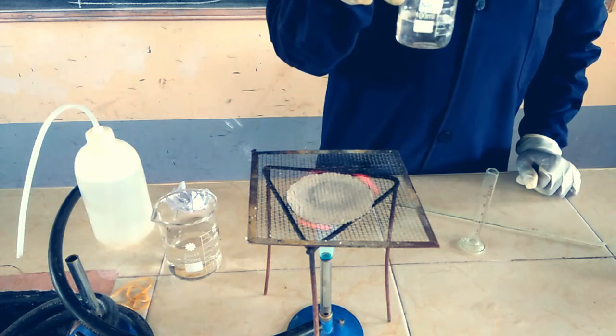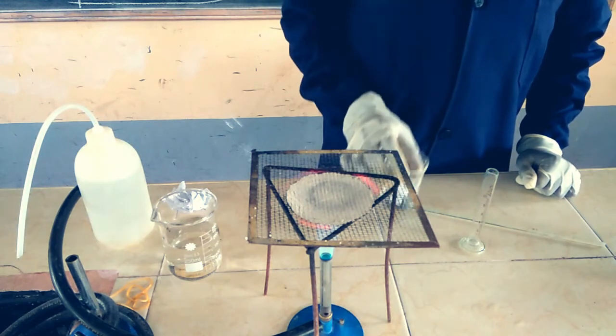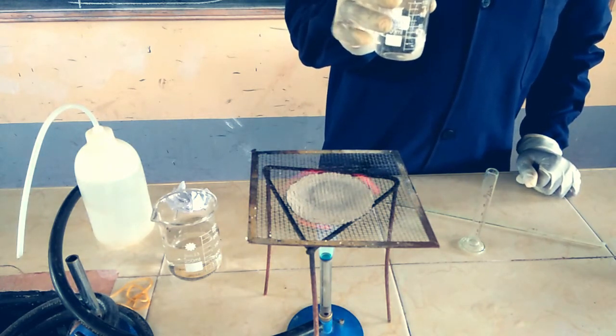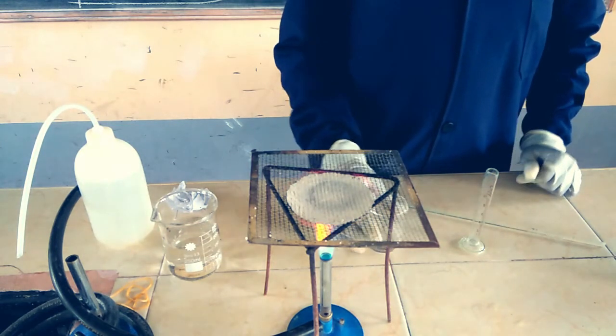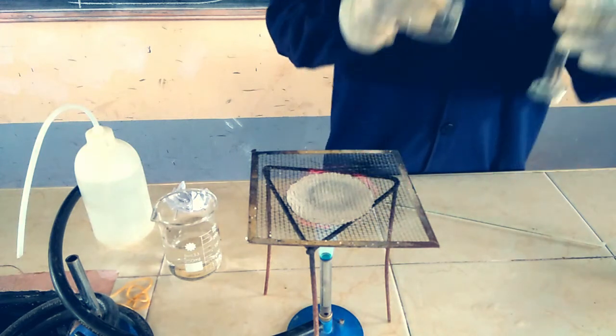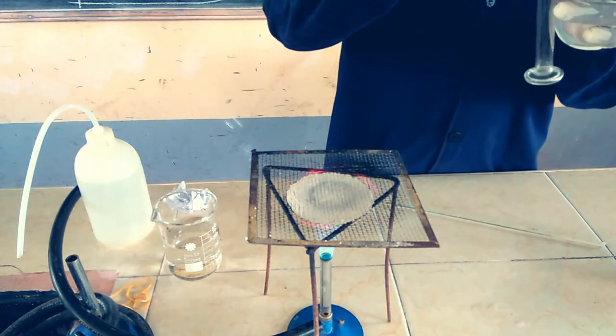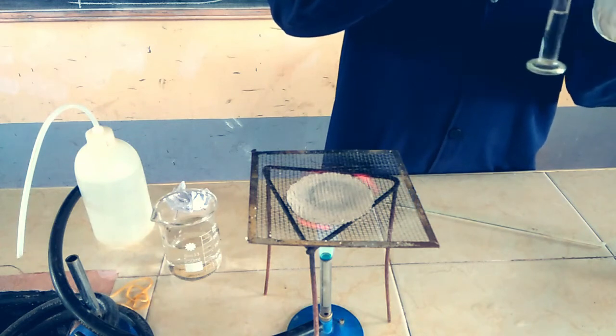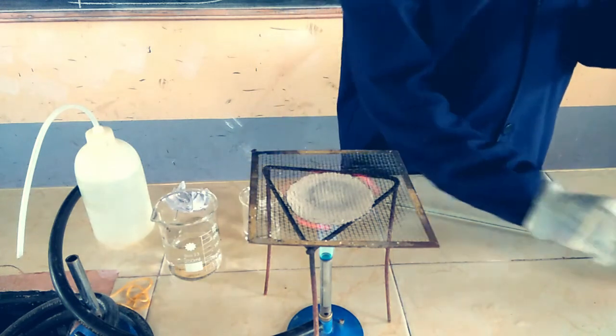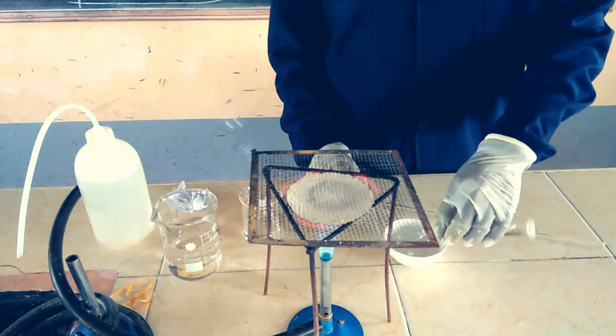So what am I going to do first? I'm going to measure 10 centimeters cubed of the sodium chloride solution. I'm measuring it, then I'm going to transfer it into an evaporating basin.